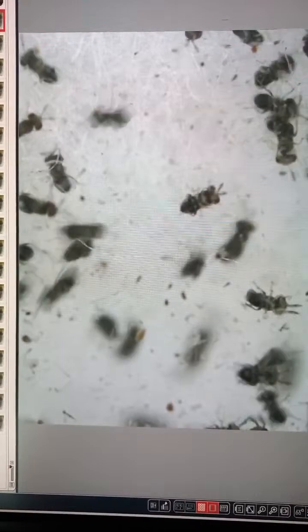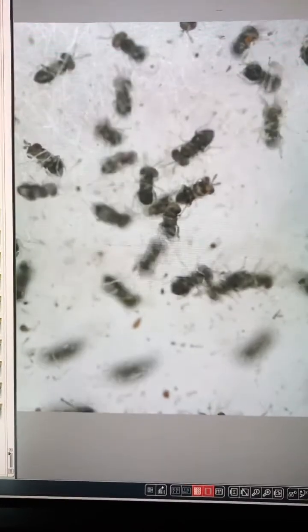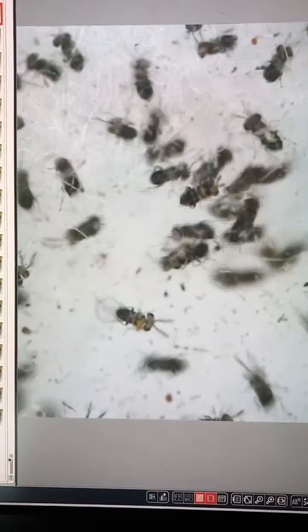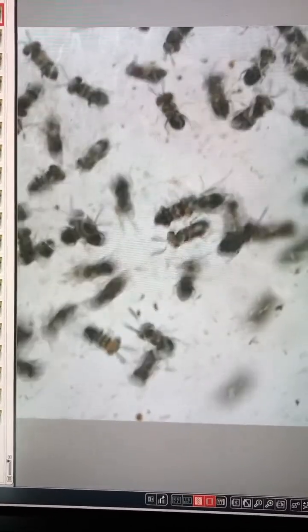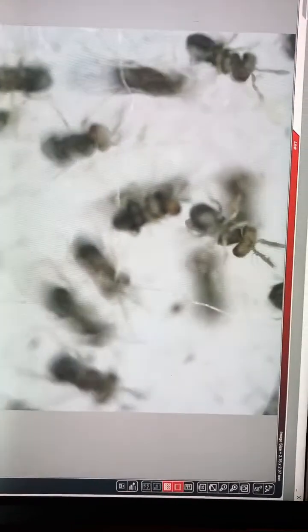In the central part, this is a female is sitting. Just can try to take a bigger magnification. I need to move petri dish to the central part. And male just nearby on the right side. Come on, come on, come on. And watch. Here, up where this is a male, down there this is a female. I can use focus measurement to see focus up and down.